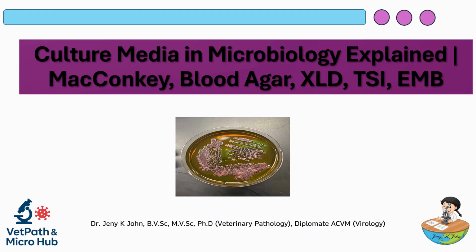In this video, we explore the most commonly used bacteriological culture media, and you will learn what makes each medium special, how they work, and what to look for while interpreting bacterial growth. By the end of this video, you will have a clear understanding of these essential microbiology tools and how they help identify bacteria in clinical and research laboratories. Let's get started.